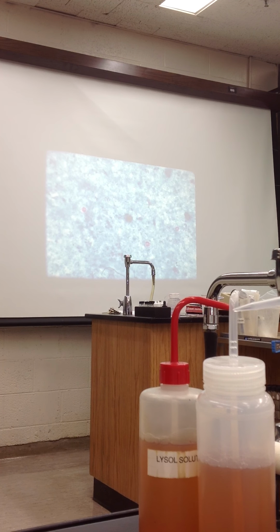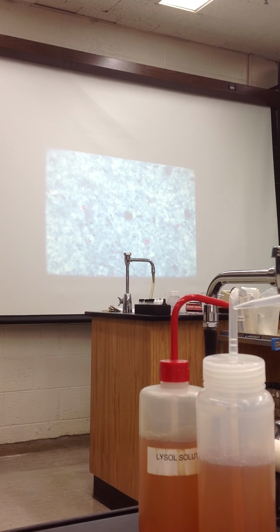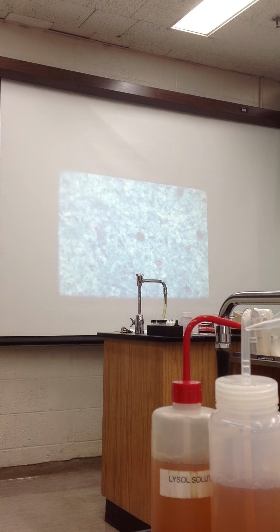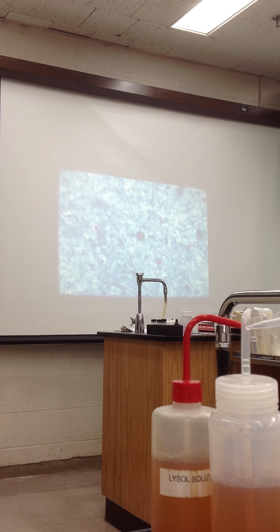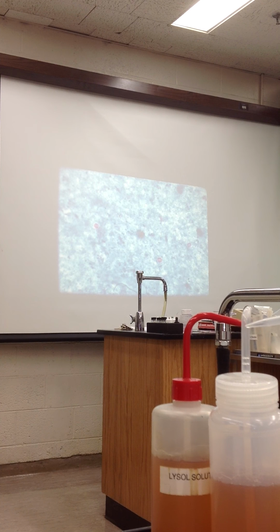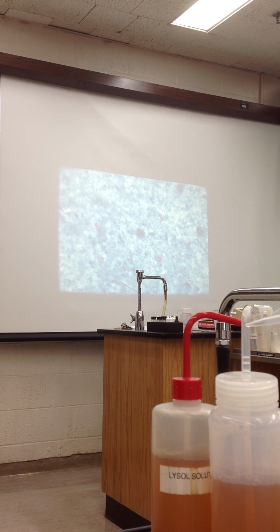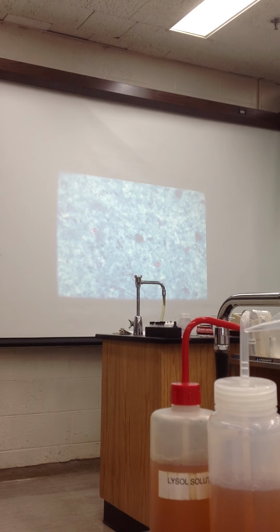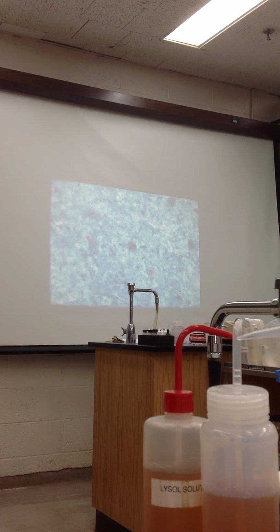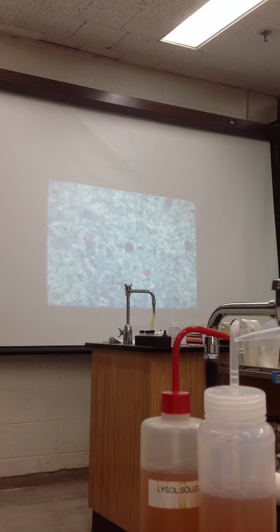Miss Penny, you know what that is? It's an acid-fast, but what is the name of the organism? Okay, in other words, in an AIDS patient with diarrhea, we can do an acid-fast stain on the stool, looking for a parasite called Cryptosporidium. So this is a Cryptosporidium.